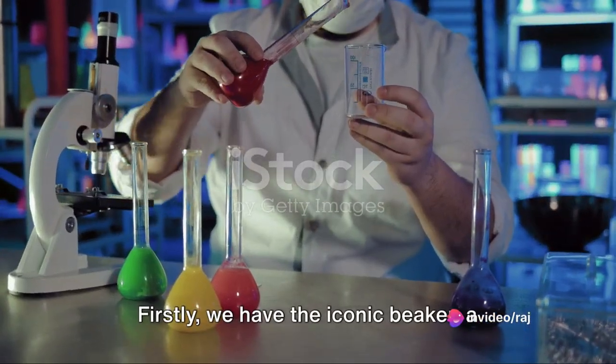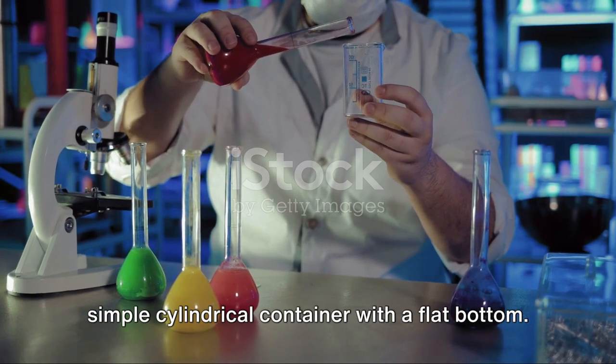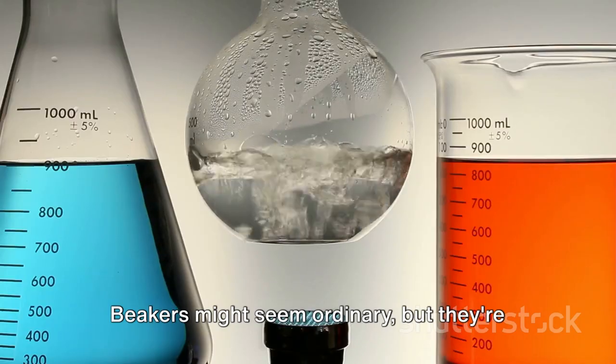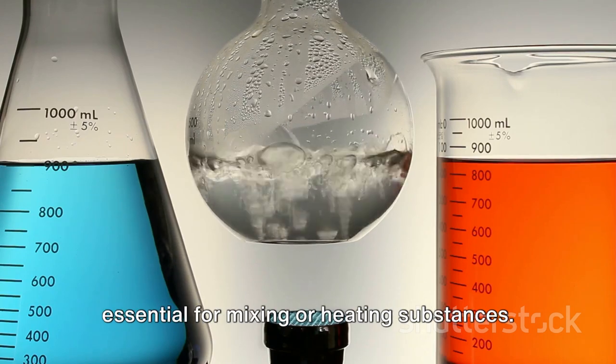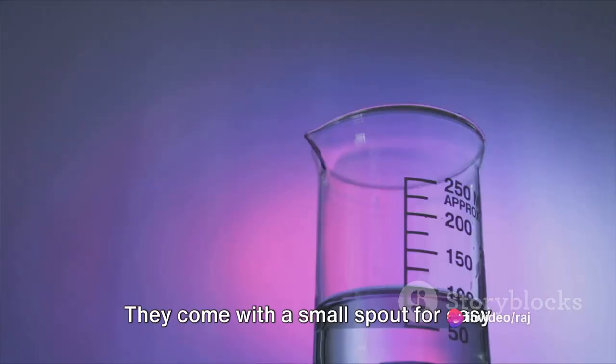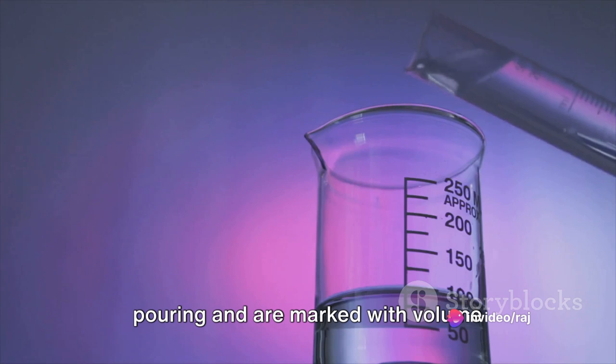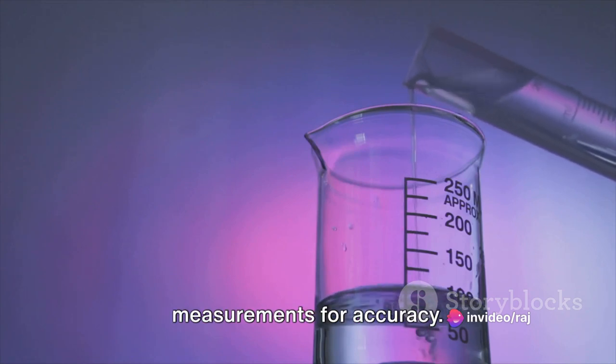Firstly, we have the iconic beaker, a simple cylindrical container with a flat bottom. Beakers might seem ordinary, but they're essential for mixing or heating substances. They come with a small spout for easy pouring and are marked with volume measurements for accuracy.